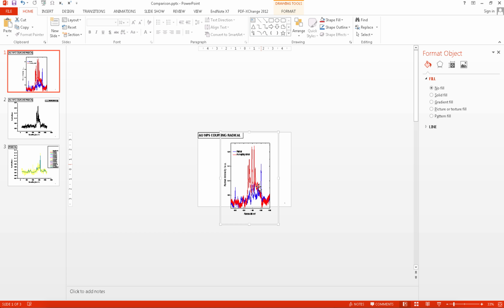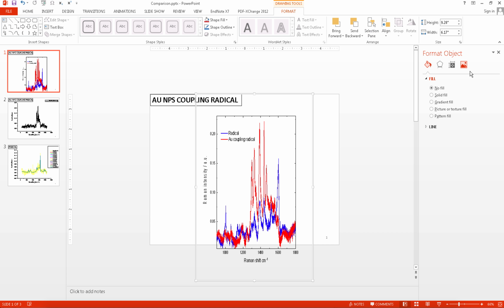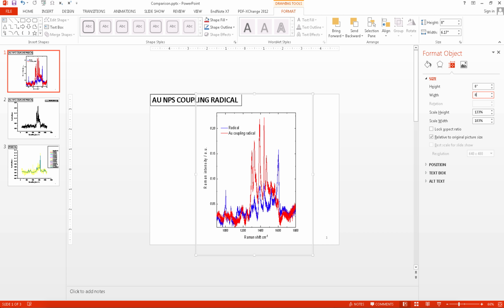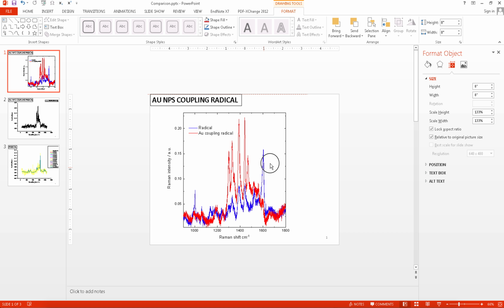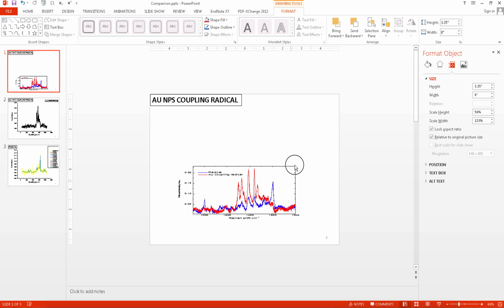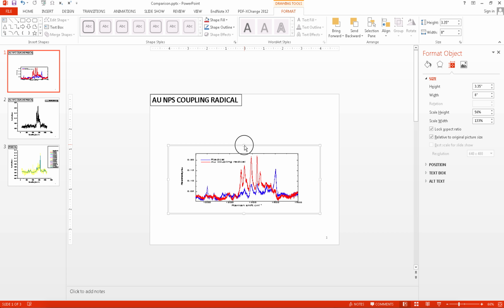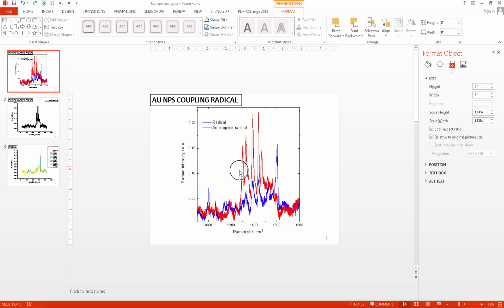So, I see that the aspect ratio of this one is not correct. This is very bad. Well, it's awful. So one way to fix it is, let's say, put it here 8 and here 8. I put the same aspect ratio, then lock the aspect ratio. If you want to resize this window, don't do what some people do, really stupid, like change it like this. If you want to make it shorter or taller, you change it like that. That's a stupid way to do it. Please don't do it. You change the aspect ratio completely, it looks awful.